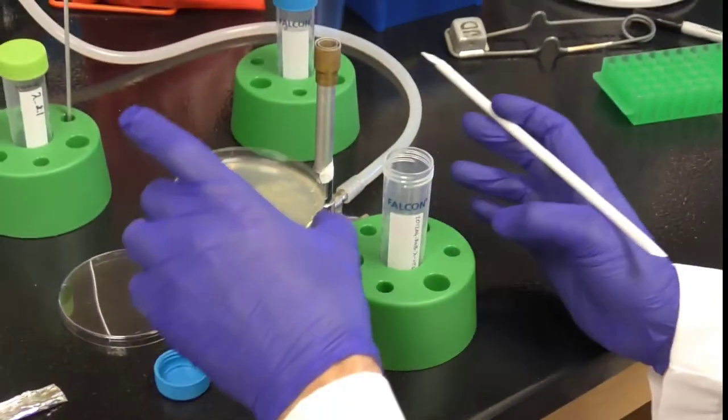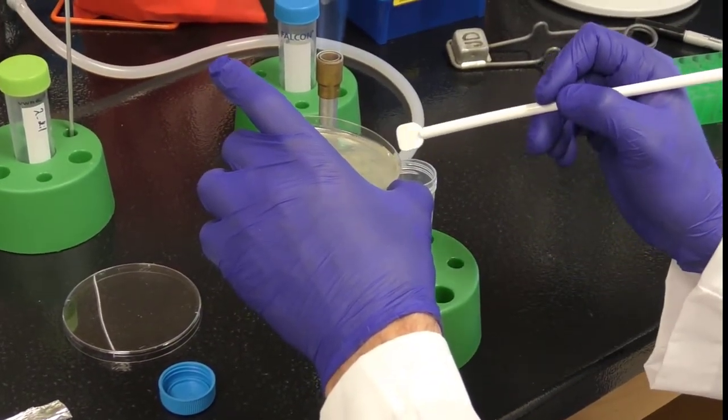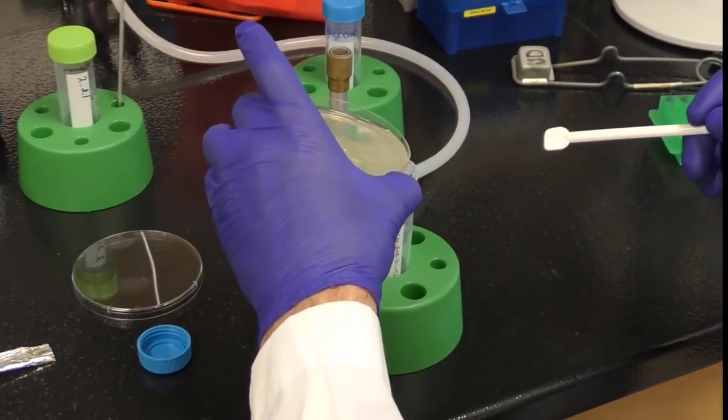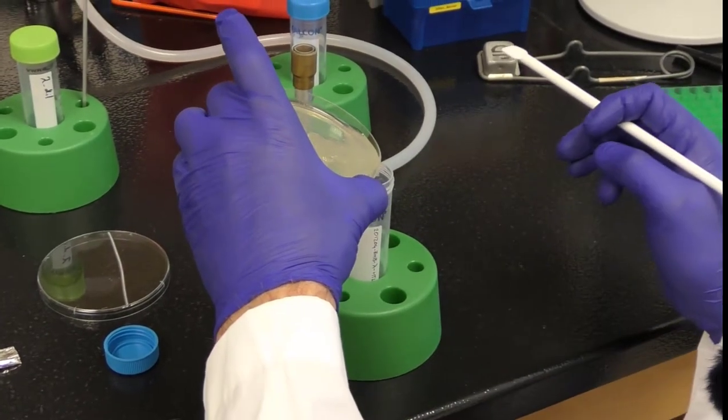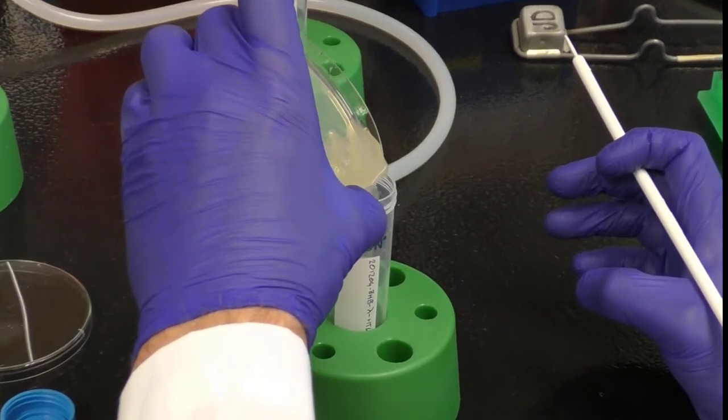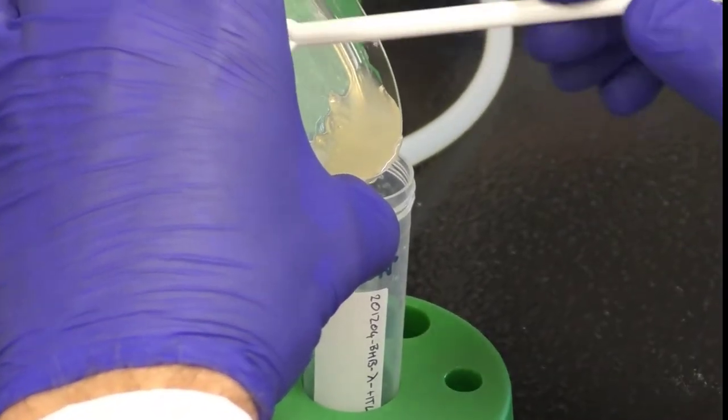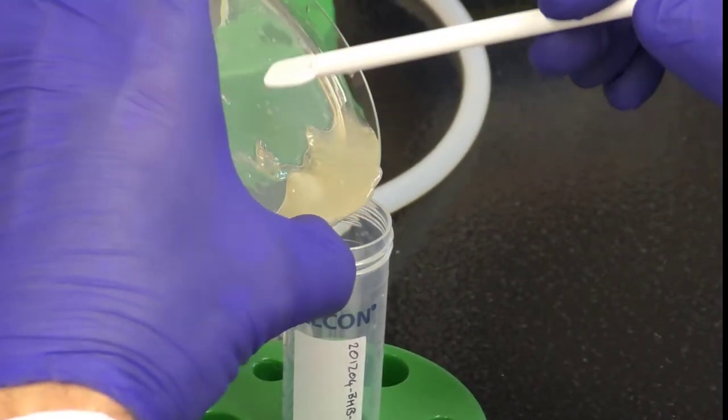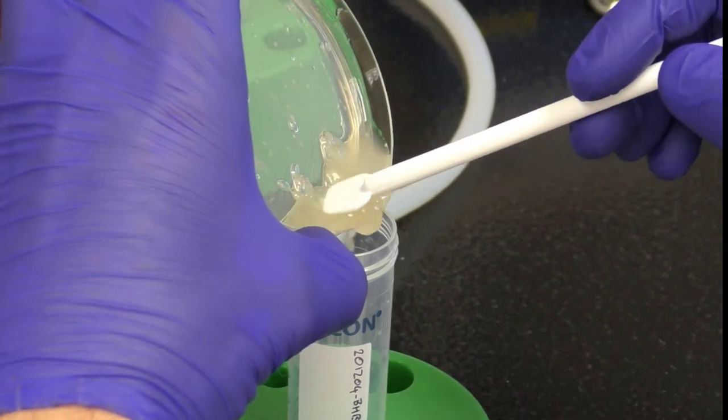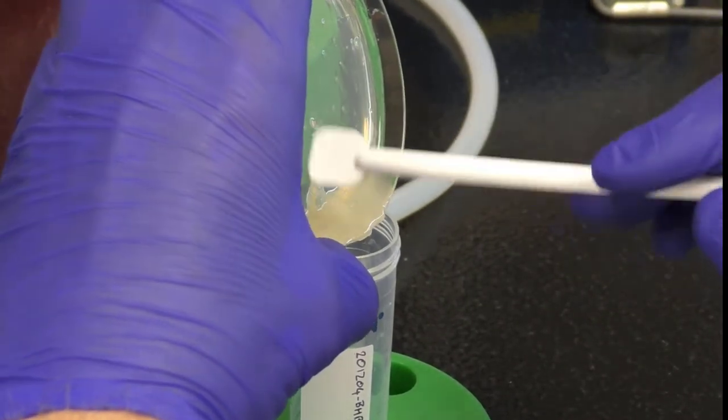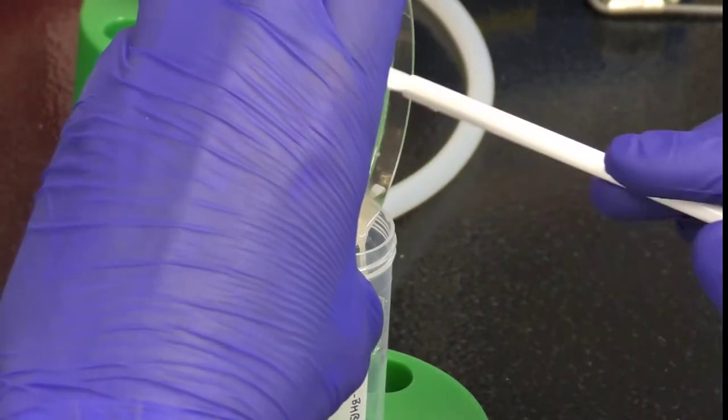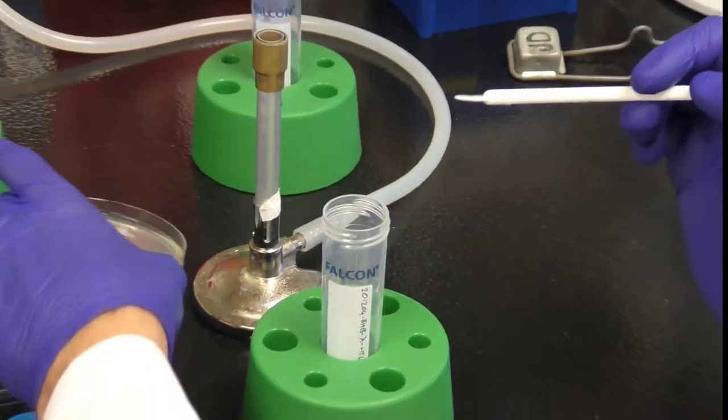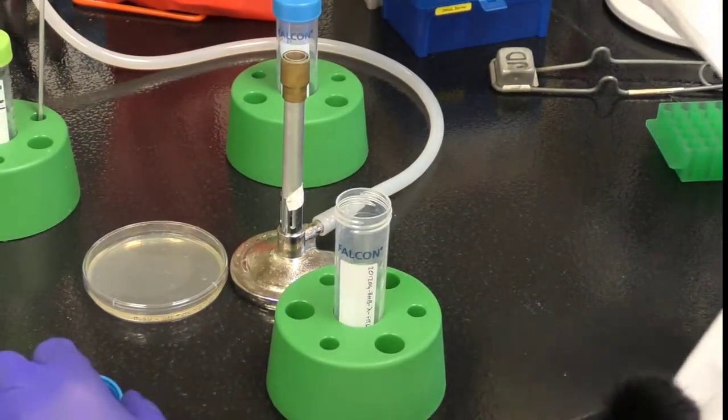Now the one trick here is that if I dump this this way, the liquid will hit the side here and will pour off of the bottom corner of the plate. So I want to put the plate over to the side so that when I pour the liquid it runs into the tube. And then just carefully scrape all of the remaining material into the tube. Take your time. There's no big hurry. Once you're done, the plate is finished.